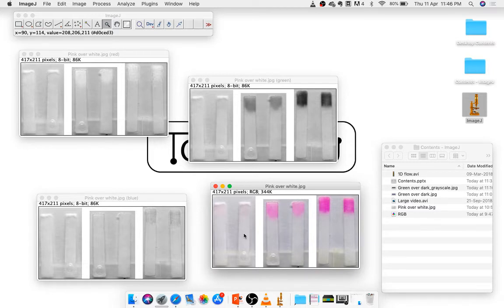Now, if I go from white towards red, the coordinates for red in RGB are 255, 0, and 0, which means that from going from white to red, what changed was not my red channel, but my green and blue, because white is maximum R, G, and B, and complete red is maximum R but 0 G and 0 B. And therefore if you have any color that is close to red, you should analyze them in either the green or the blue channels.